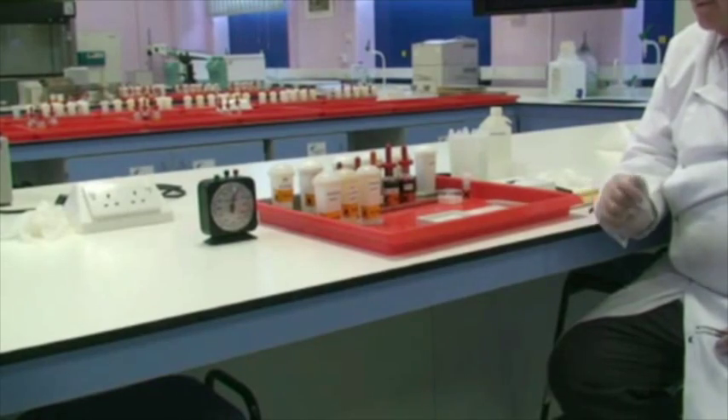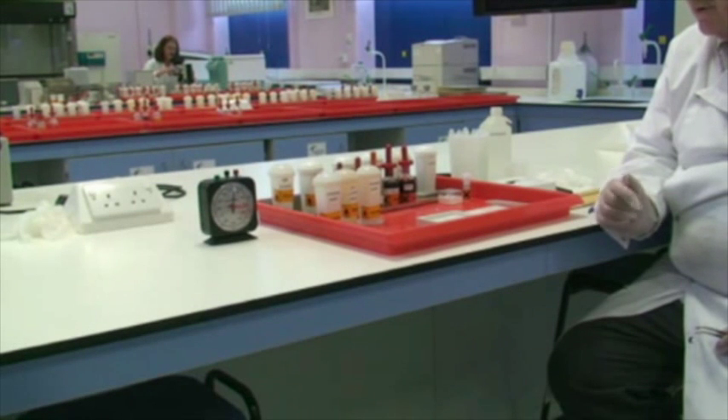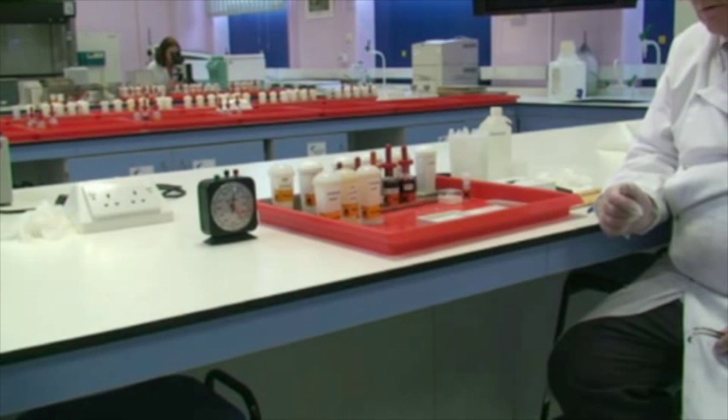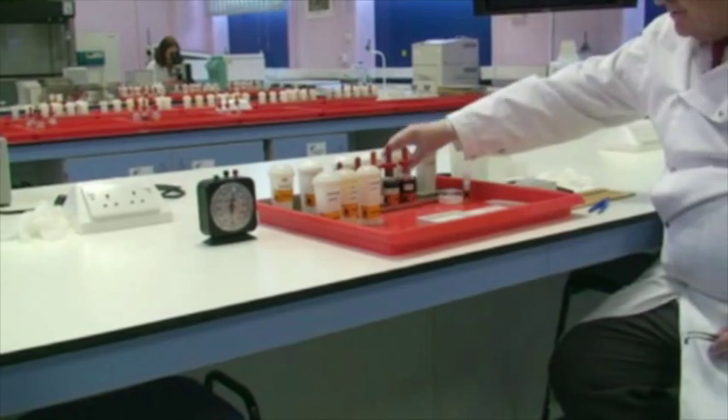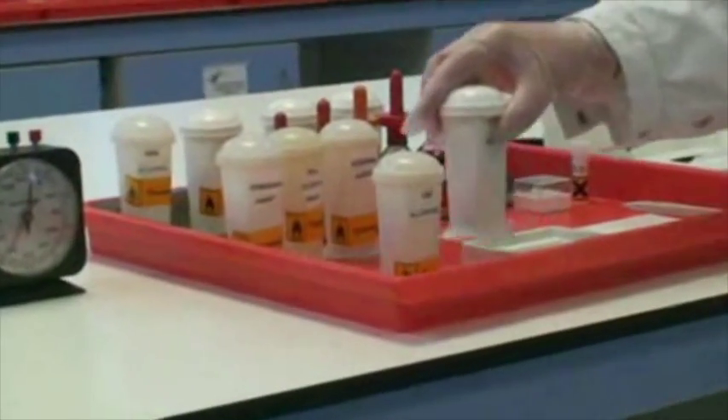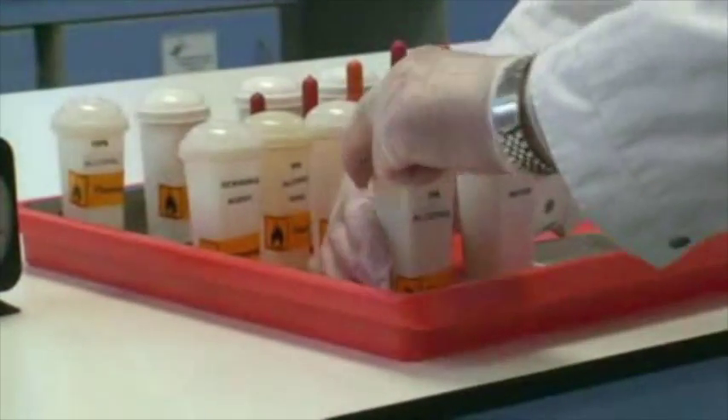We have now gone through the initial process of de-waxing and taking the sections to water — that is, hydrating through a decreasing concentration of alcohols. The slide is currently in the 70% alcohol, and we are now about to transfer across into water. I'll take out the 70% alcohol where our section is and transfer it across to water.